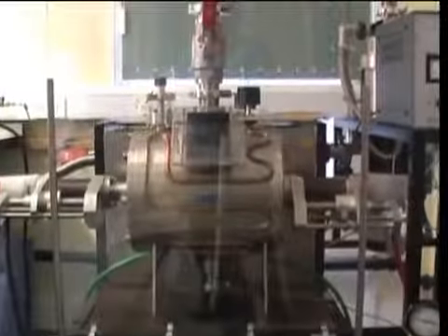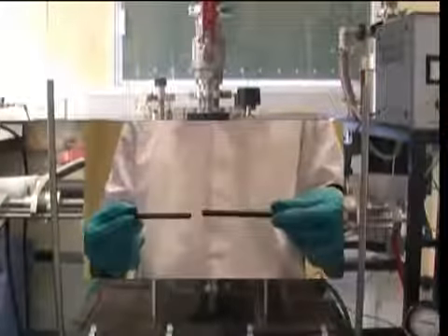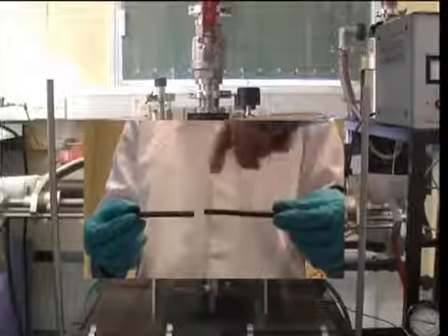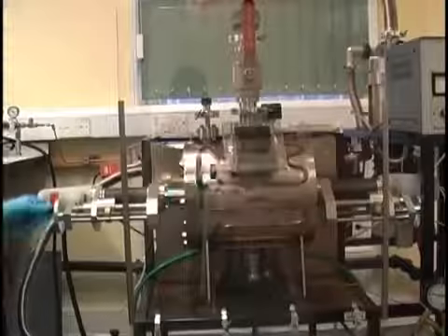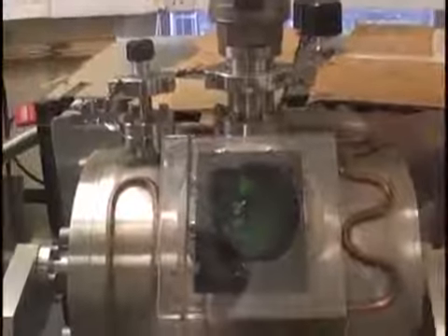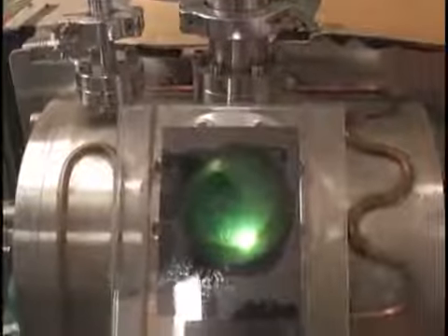This is the chamber for the arc discharge, which is filled with an unreactive gas. Inside, two rods of graphite will be placed and we will apply a current. One of the rods will be the anode and the other will be the cathode. When the two rods are brought together and the current is applied, a spark is produced between the rods, which instantly vaporizes the tip of one of the rods, and this carbon gas forms the nanotubes.